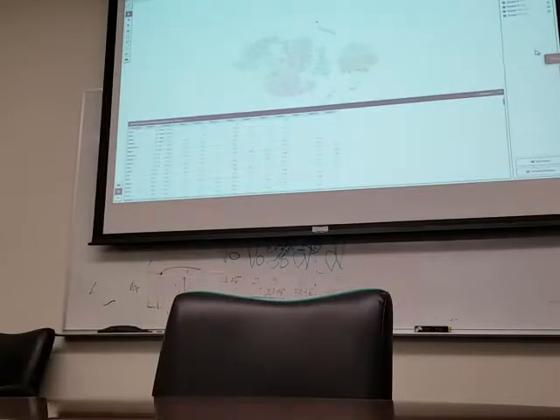So maybe one of these clusters, here. Which cluster is that one? That's cluster 9. Okay, can we look at the heat map for that and see? It's different. I know that guy. He's monocytes or something like that. He's not a B cell. Maybe T cells.